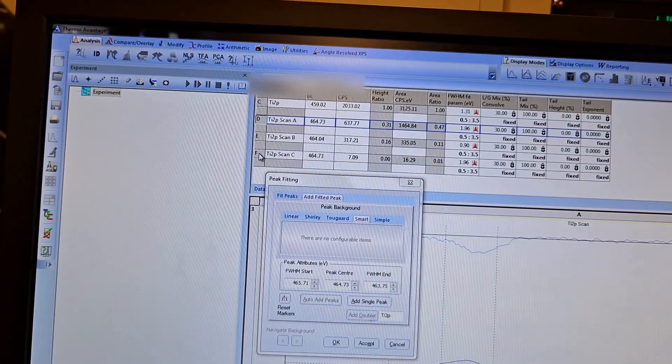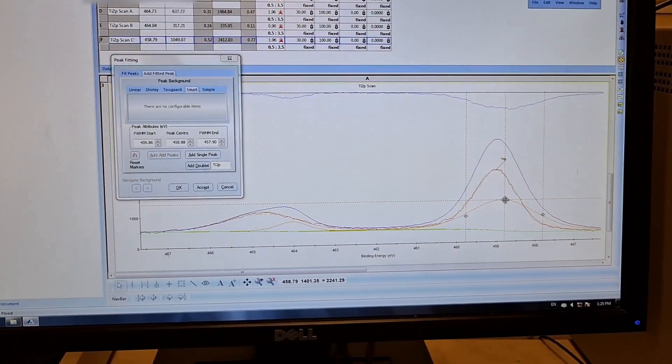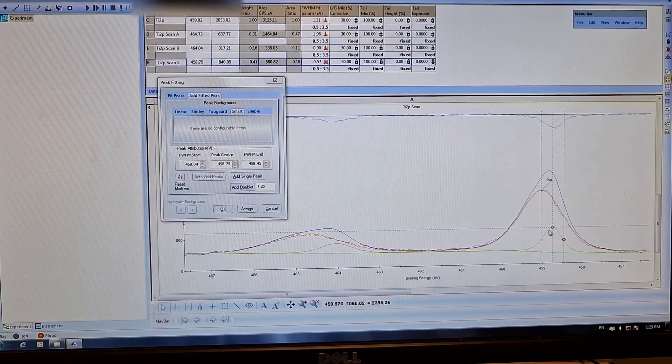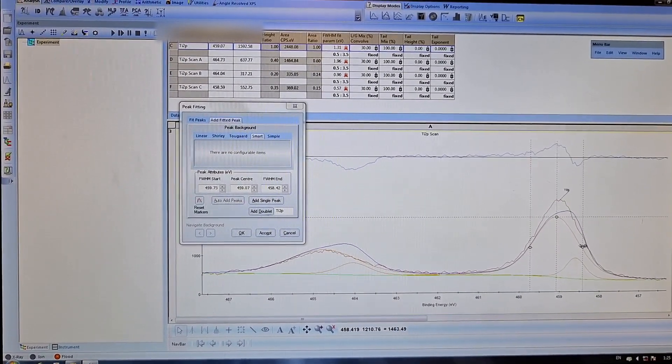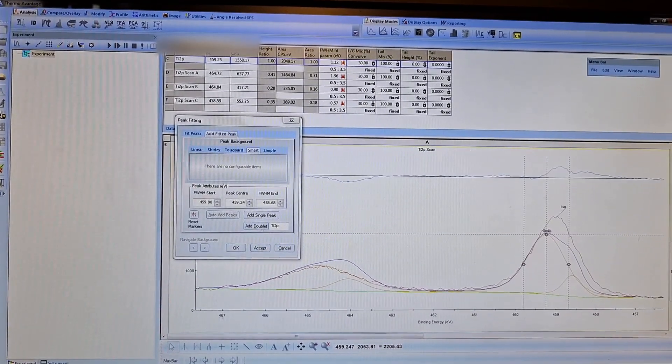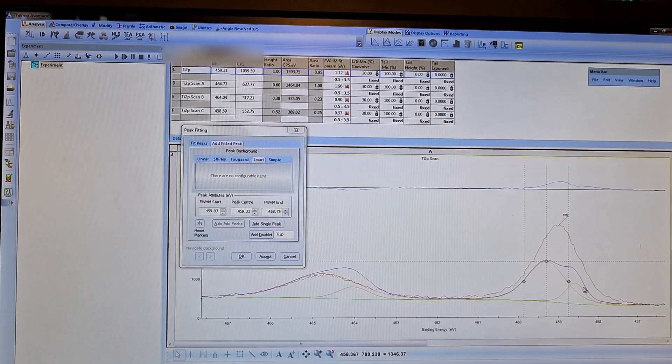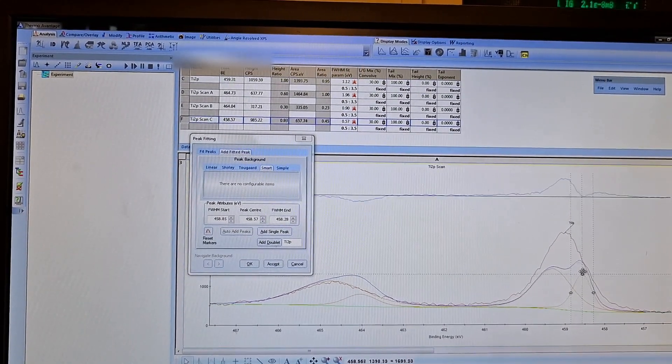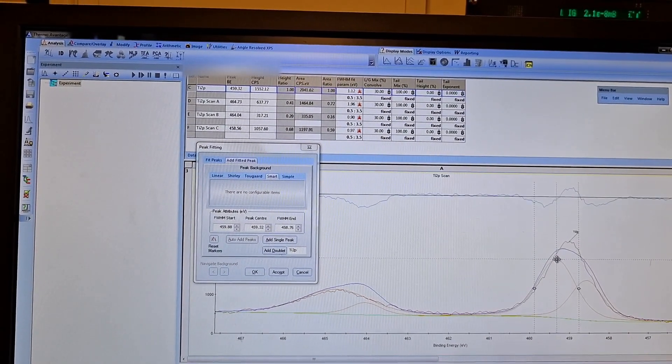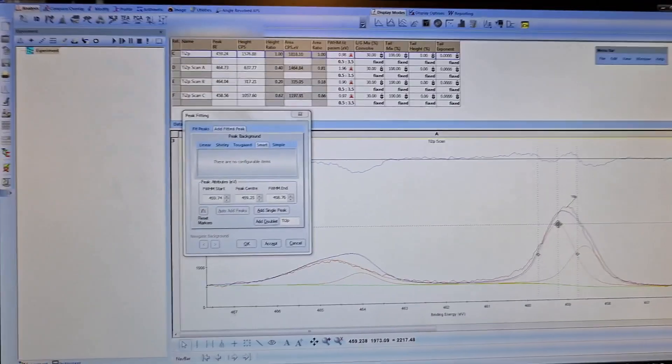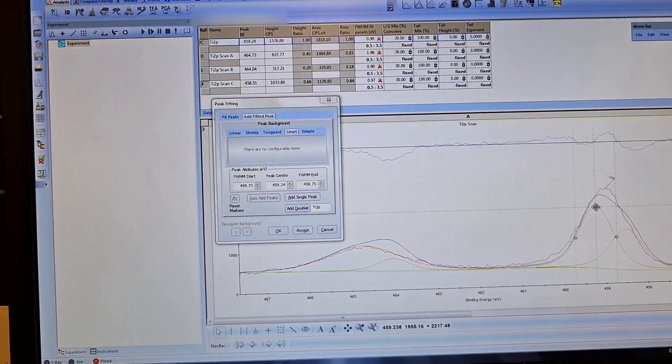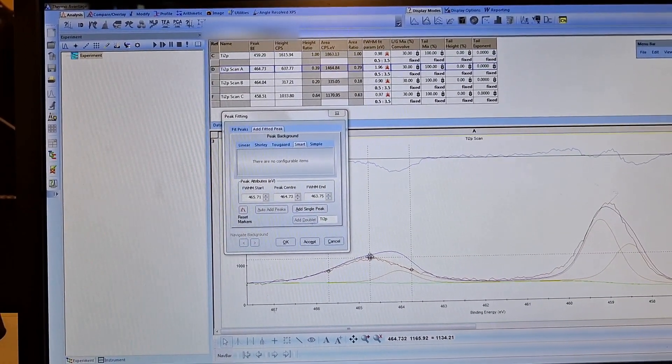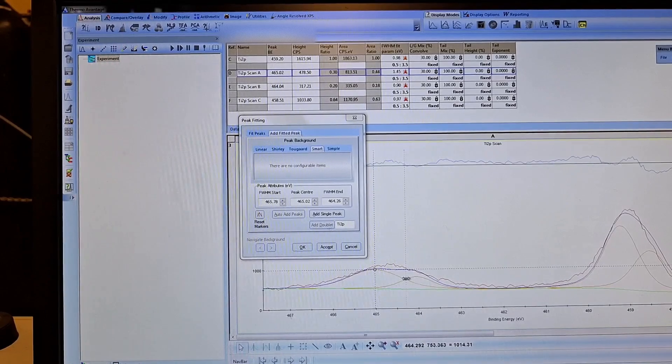It is titanium 2p1/2 peak. You can see it's here, but I want to put it here. I will decrease the full width at half maximum of the peak. I will make the 4+ smaller. This is 3+. The other is here. Titanium 4+ binding energy should be higher than the 3+. This is the titanium 4+ peak. This is also titanium 4+ peak.